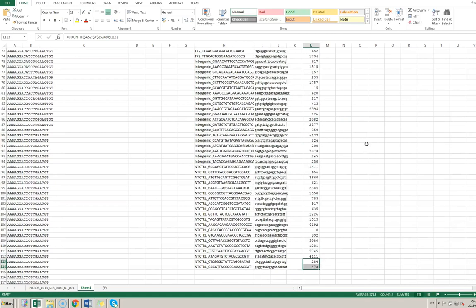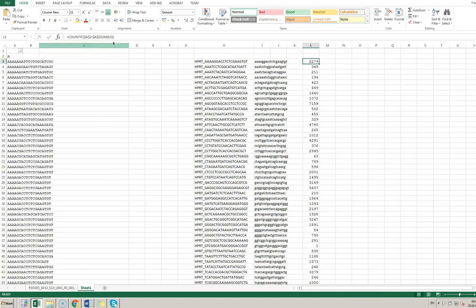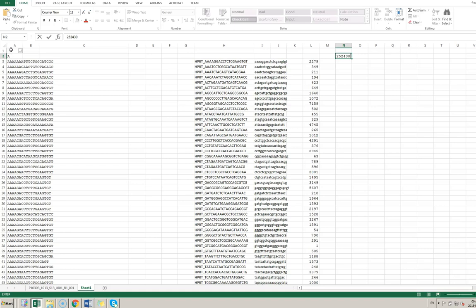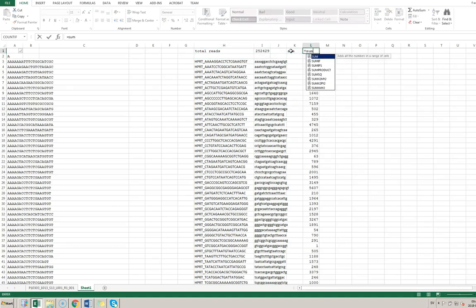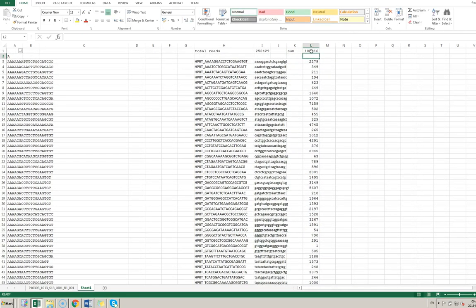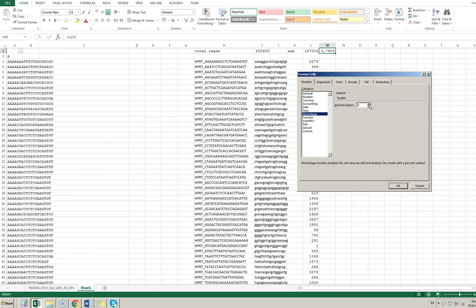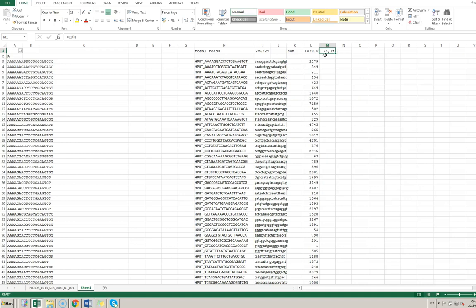It took a while to calculate. The last row was index 25,2430, so the total number of reads we picked up was 252,429. The sum of all perfectly matched reads is 187,000. So we find a perfect match 74% of the time, which is kind of what you would expect — you'd never expect 100%. This is maybe a little on the lower side, but it's in the expected range.